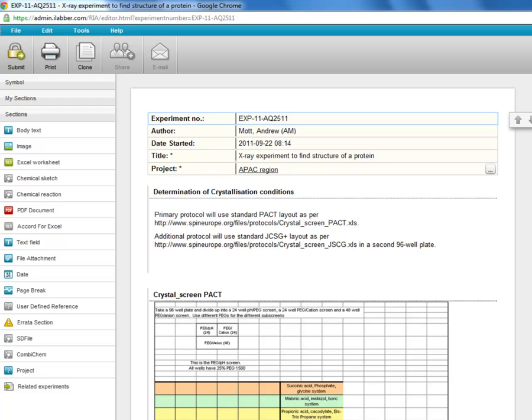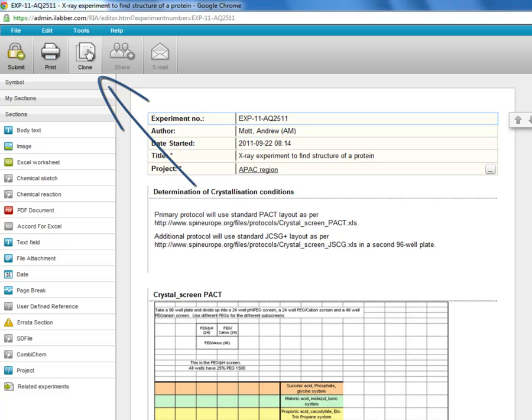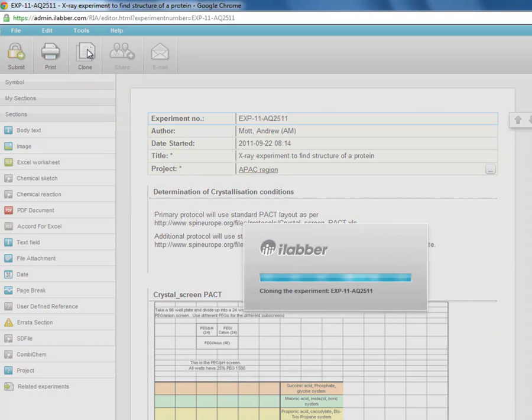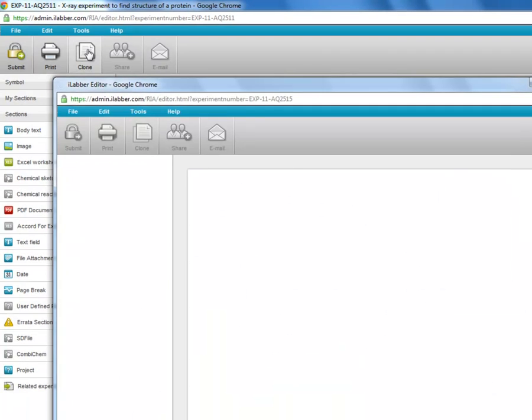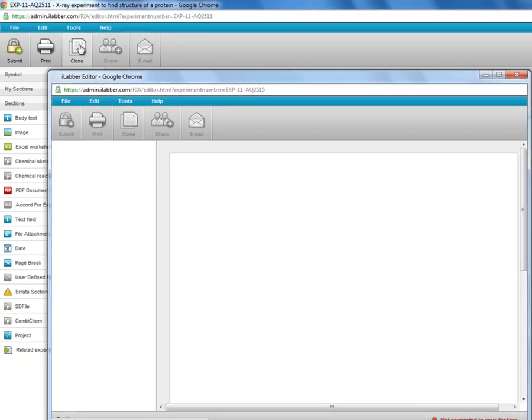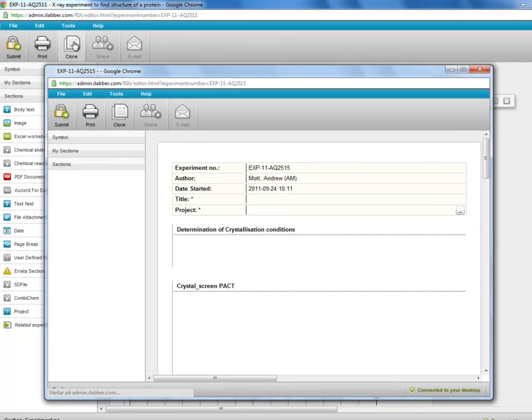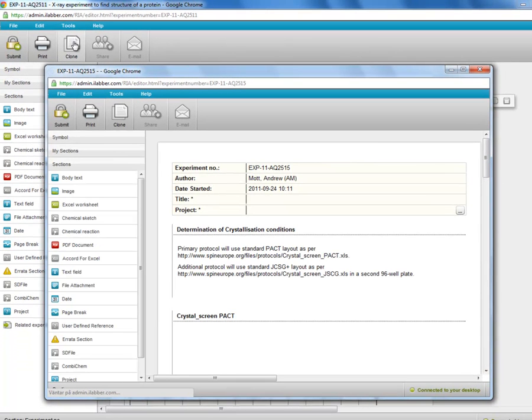So here I have an experiment and I'm going to repeat this work so I'm going to clone it. And all I have to do is go up to the clone button on the toolbar, click on the clone button, and the new experiment is then opened.